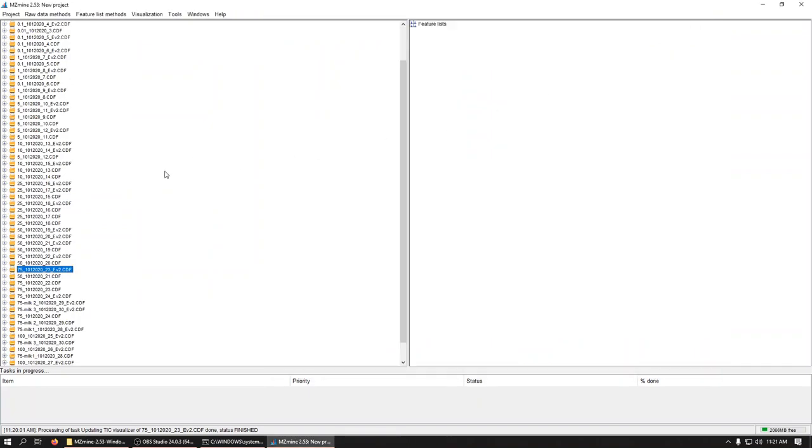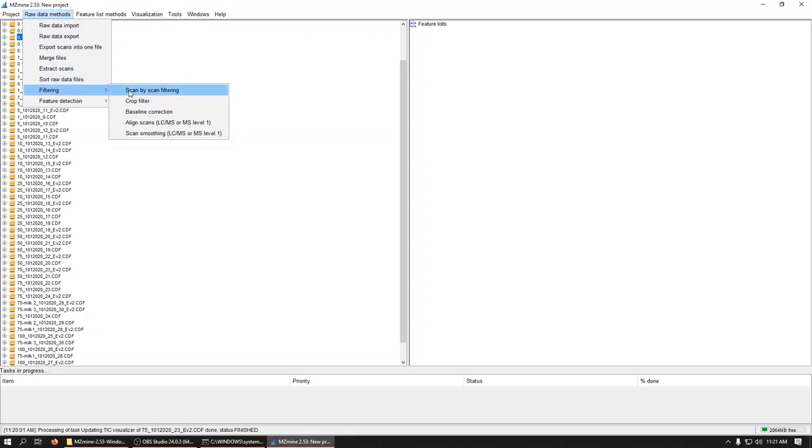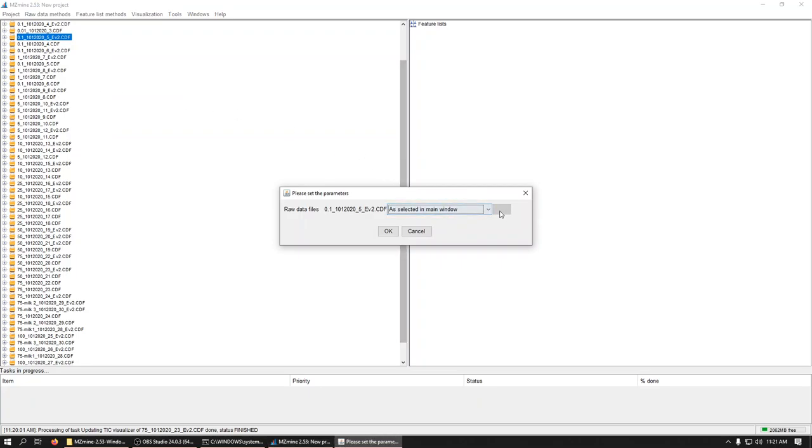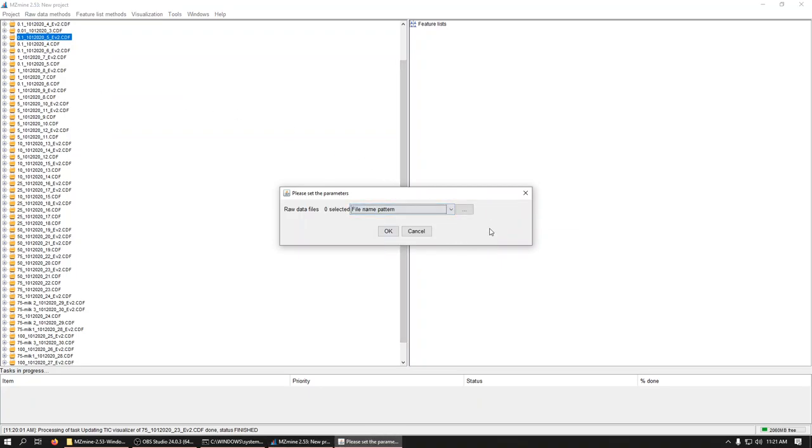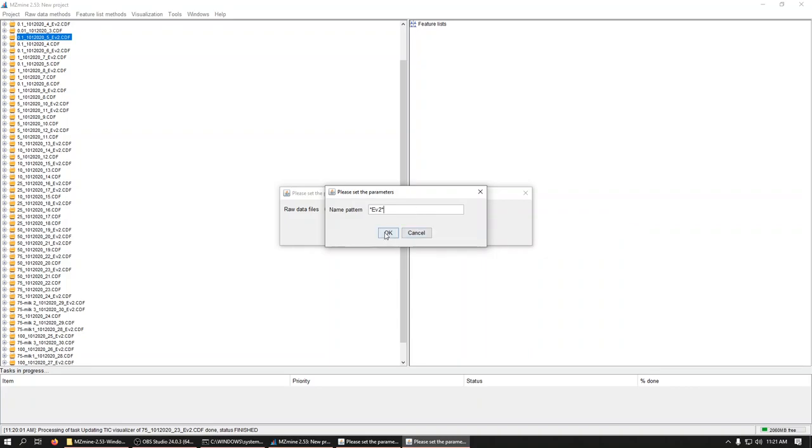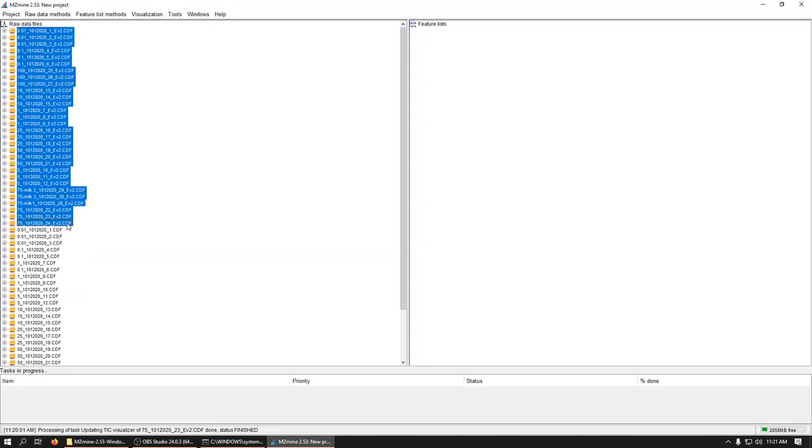We've got the data we want. And when we're doing quantitation, we'll actually want to look at just this event 2 model. So what I'm going to do is I'm going to do a sort quick. So I'm going to do raw data filtering. Sorry, raw data, sort raw data files. I'm going to do this file name pattern. So I'll use an asterisk as a wild card. And I can do EV2 for event 2. Another wild card. Okay. So that puts these all together. These are the ones that I actually care about. And we'll sort them more later. But we'll start off by selecting.